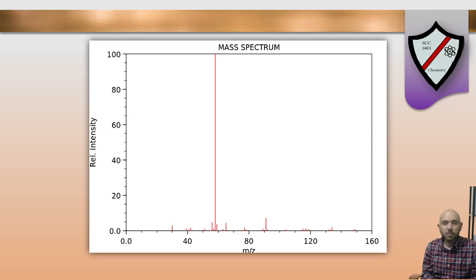And while mass spectrometers can't tell you what is on the other side, if you look at the output here, what you're looking at on the bottom is the mass to charge ratio. And we just assume that since most of these ions have a charge of 1, these are typically molecular masses down here on the bottom.